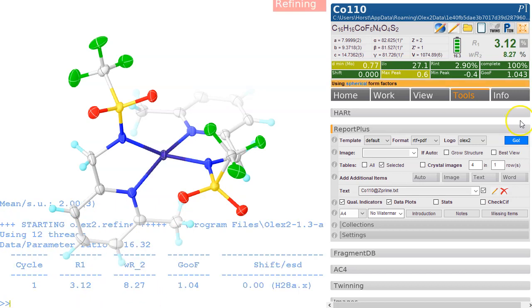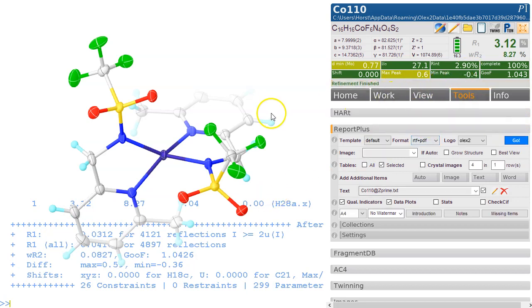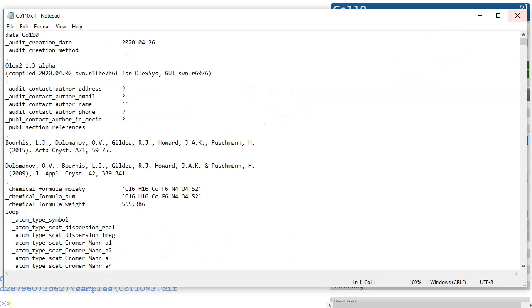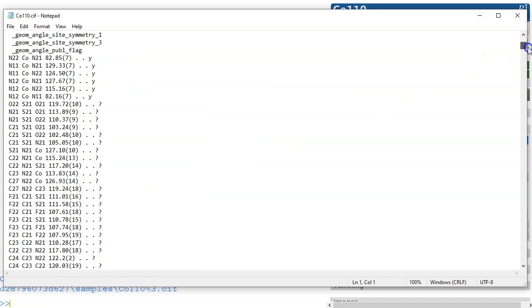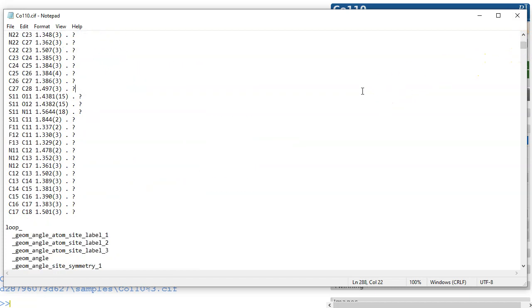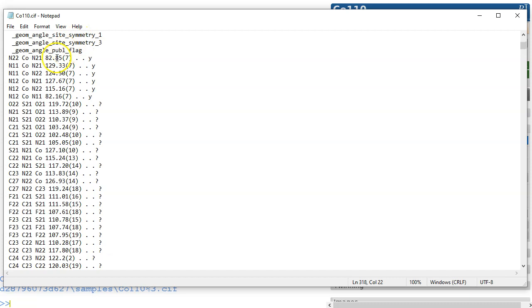If you refine this now, then this will be in the CIF file. If I go edit CIF, you will find that if you look in the right loop, there is the flag.